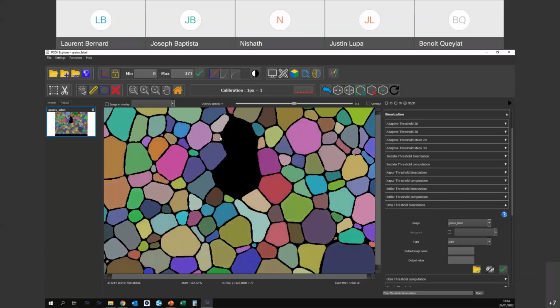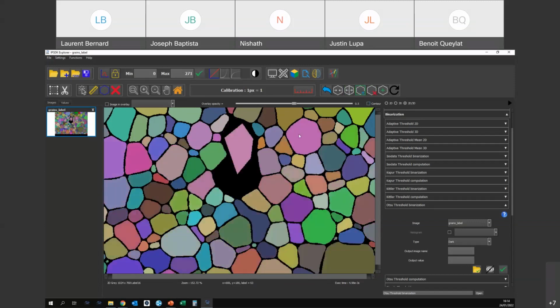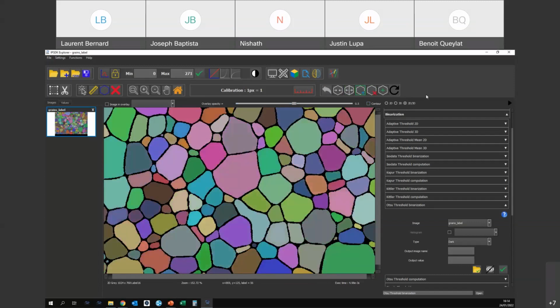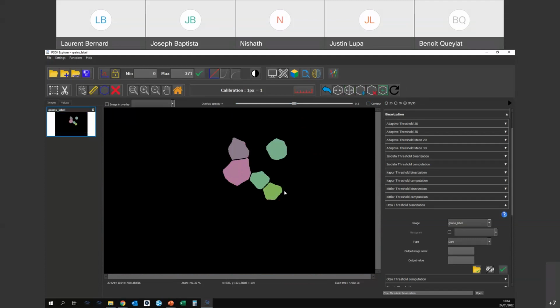You have the possibility to add some new objects. You also have the undo button. You can define how many undos you want to save, but now there is a new icon, which is just to remain some specific particles. Instead of removing all of them, to remain only one or two, you can just tag the ones that you want to save and to keep.